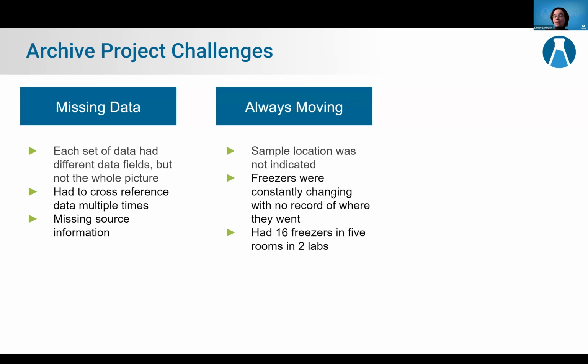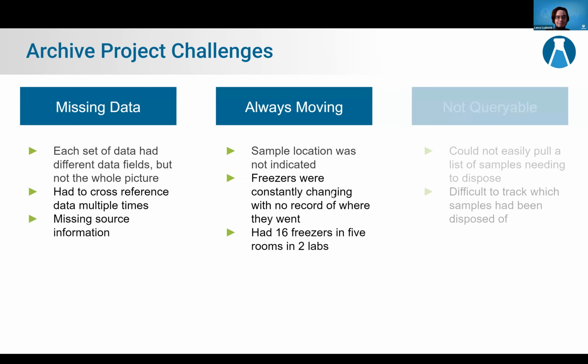And one day I would go into the freezer, do an entire shelf of samples. It's like, great, I don't have to go back to the shelf. But then the next day they had to move boxes around. So I kind of had to start it from scratch. I ended up having to mark these boxes with Sharpies just to try to signal, hey, I already worked on this box. I don't need to come back to it. So not only did that cause a lot of issues, but it took a lot of time as well.